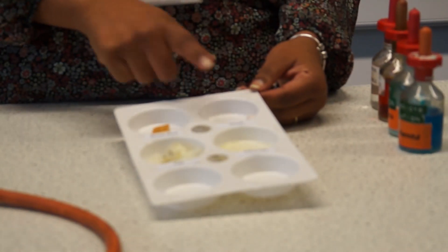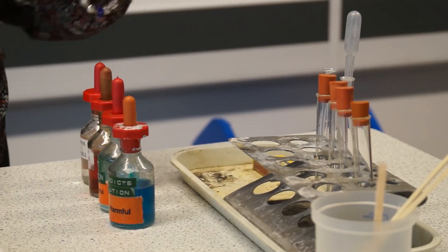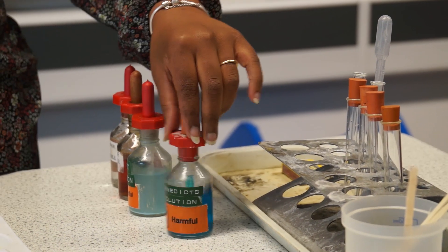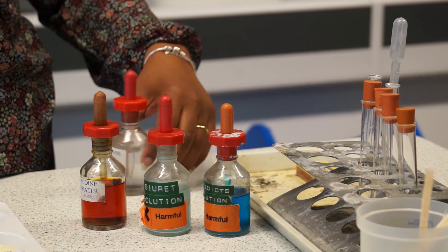So we've got starch, sugar, protein and fats. We've got a range of different test tubes. We've got chemicals to test for the presence of a specific substance. So we've got Benedict's solution, Biuret's solution, iodine and ethanol.